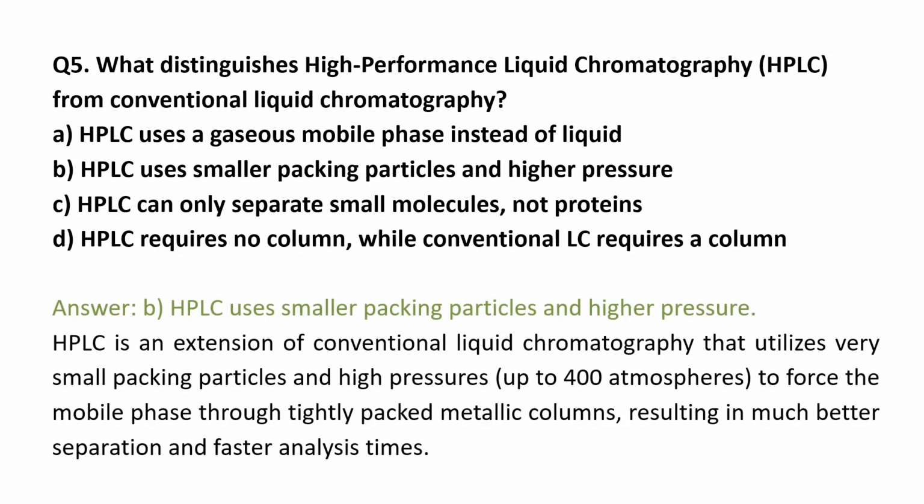So the answer is HPLC uses smaller packing particles and high pressure.